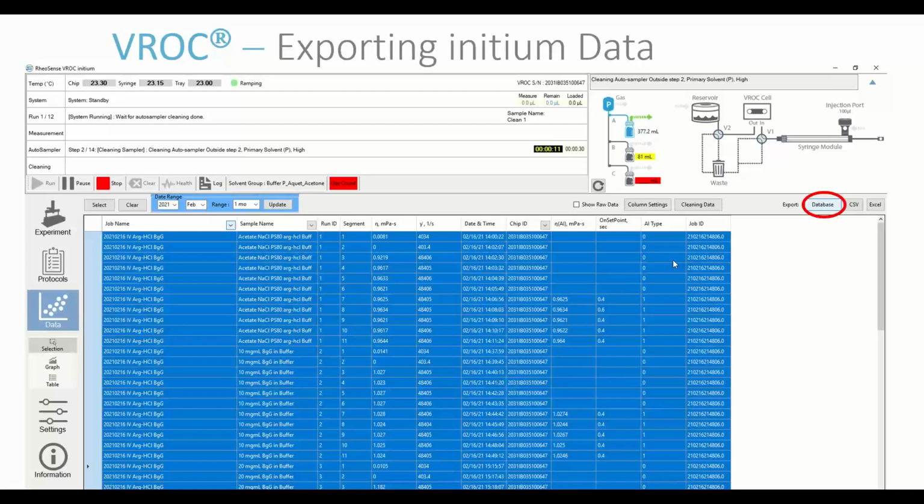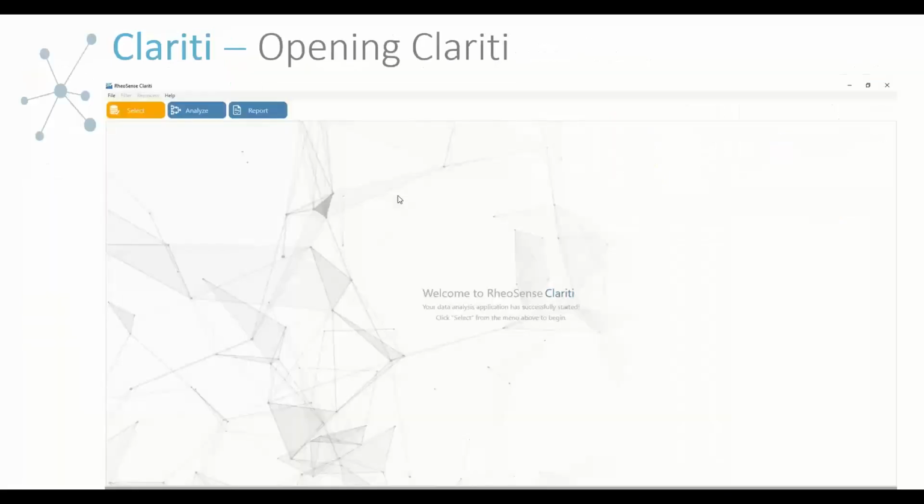So I'll take a step back and say that initially I'm just going to show you different screenshots of the software and everything, and then later I'll go into a live demo. I encourage you to ask questions during the live demo. I have Stacy here with me. She'll let me know if there's been a question, and then I can hopefully answer it or even demonstrate it once I open up Clariti. So with that in mind, move on to the next.